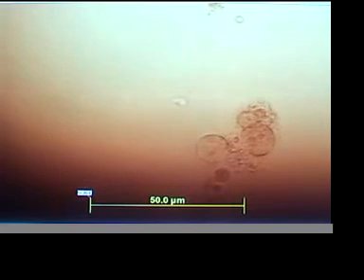Oh, it's still continuing here. Something's happening. Little action. Okay, and let me just back out the microscope so I can tell you. Oh, there's another one happening in the same square. Let's see if we can get it. There it is.